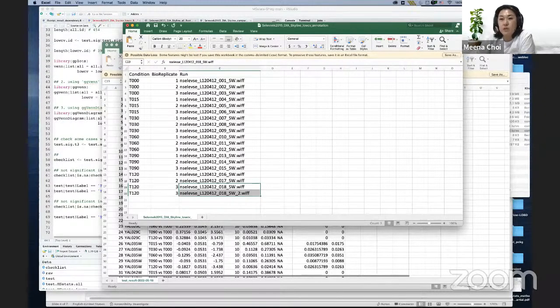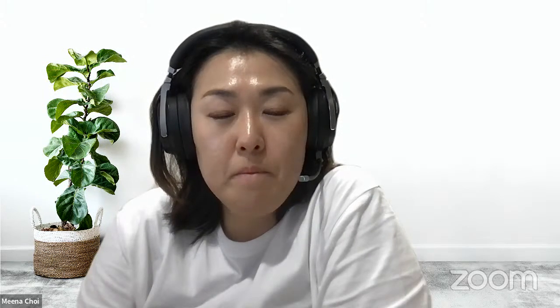Do you have any other questions? And if you have an error or any suggestion about the MSstats Shiny, something not working and something is not what we expected, please report to the MSstats Google group, and then Devin and then Matthias can help, and it will also help to fix the bug.